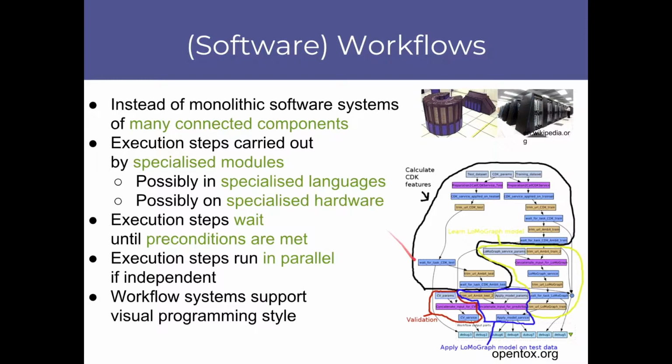The execution steps down here, they will wait until the data has arrived from above. So until the preconditions are met, and it can then continue with all its inputs. If there are parallel executions, they can run on different nodes in your compute cluster, and I'm coming back to that later. And another nice thing is that these workflow systems usually support a visual programming style that is much more pleasing and more intuitive to navigate if you're not a hardcore bioinformatician.